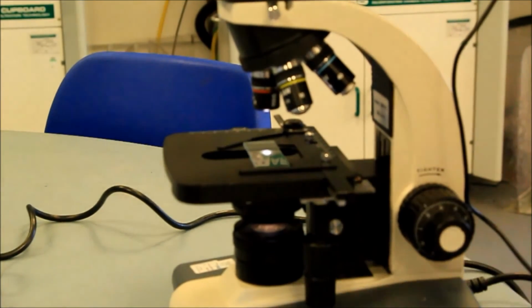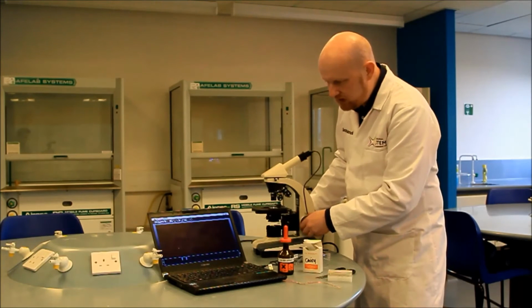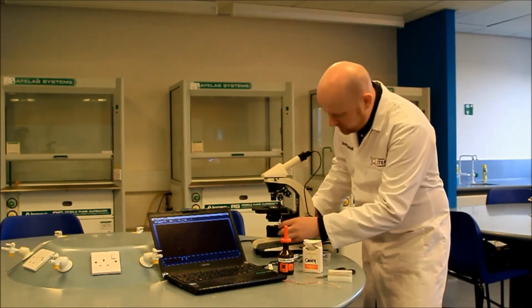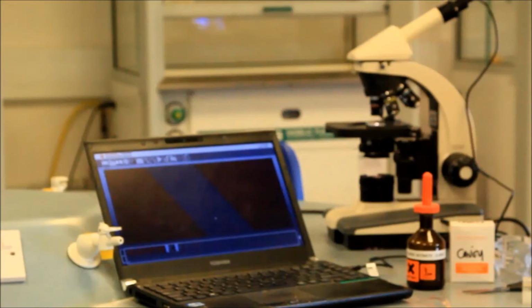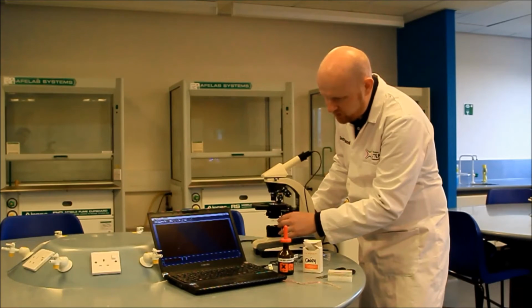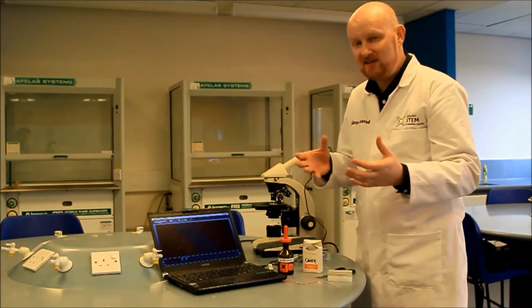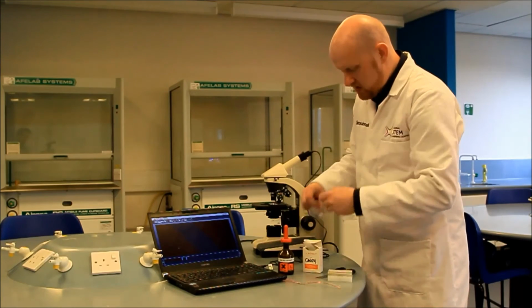Now, the reason I'm doing it this way is to allow us to focus in using the laptop. If I was doing this just down the microscope, I'd probably put it all on the slide and then put it onto the stage. So, let's focus in, and there we can see the copper wire. Just move that into the centre of the frame. That's all done. So when the reaction starts, we can see it straight away on the screen, which is really good for the students.